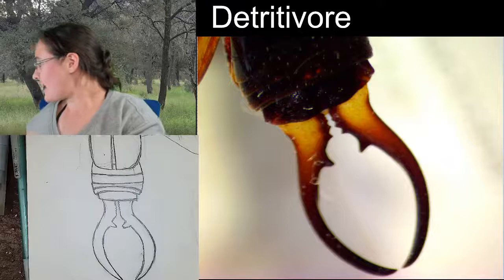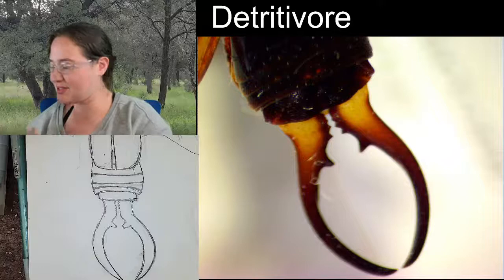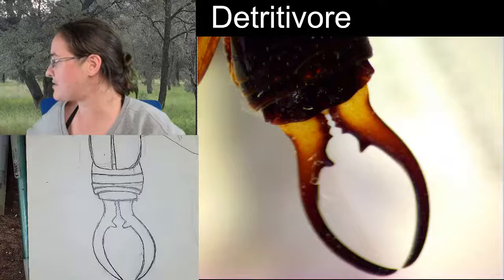I'm going to be turning our specimen upside down so that we can see some of these legs. I did just take off the labels of our specimen, so I need to remember to put them back on.